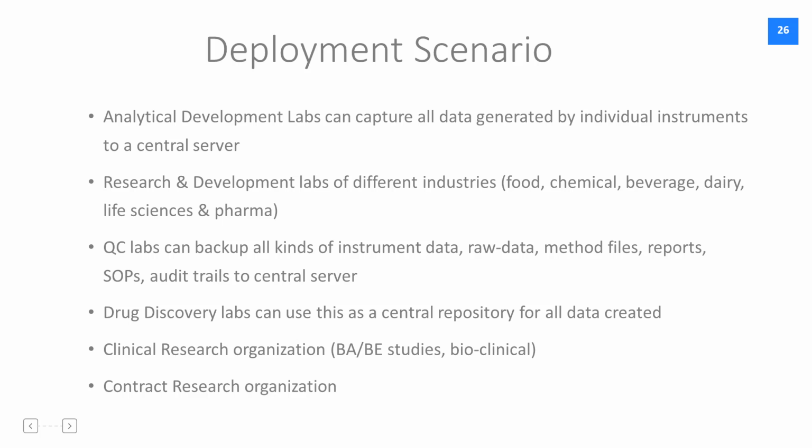Drug discovery labs can use LogiLab SDMS as a central knowledge base. Clinical research organizations who are doing BA/BE studies and bioclinical studies can store all their data in the SDMS system, and contract research organizations as well can store all their data and metadata such that their customers also have access to the raw and metadata at any point in time.